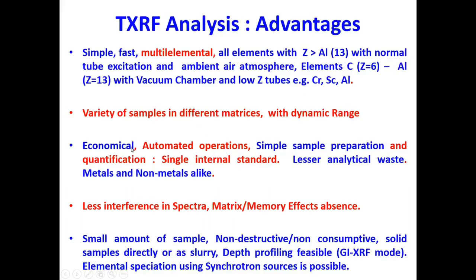This is economical. It has automated operations. Sample preparation is simple; in some cases, I will try to show that almost no sample preparation is required. Quantification is easy, and a single internal standard can be used. There is less analytical waste, which is very useful for radioactive samples. Metals and non-metals can be analyzed alike. And if you see the spectra, there is less interference, and matrix and memory effects are absent.